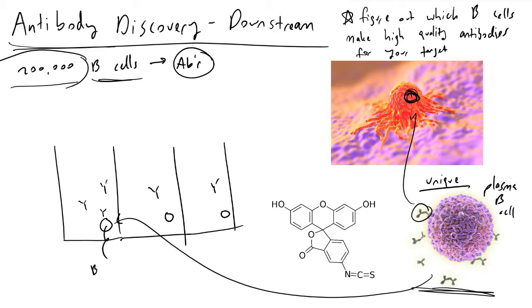So this is your B cell. And then I'll also have, we'll make it look like a bad guy, this is your tumor cell. And so I will have stuck my B cell into a pen as well as a tumor cell into a pen, and we'll have tumor cells present in all of our pens along with our B cells. In some cases these antibodies may stick onto the tumor. So let's make this a really good one in which we've got tons of antibodies from this specific B cell sticking onto a tumor cell.